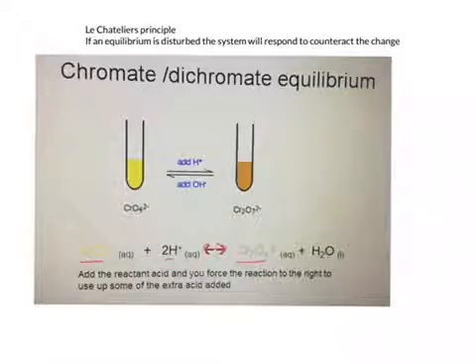That also includes acid. The observation here is that when you add acid, it changes from yellow to orange. Let's investigate whether Le Chatelier's principle could have predicted that.